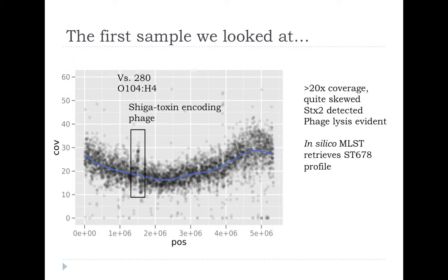So they sent us some samples, and the very first sample we looked at, we were very pleased with what we found. It was known to have a high abundance of the Shiga toxin producing E. coli. And what happened was that Nick Loman in my group at the time took the metagenome. We sequenced it on a benchtop instrument, the MiSeq, 1 sample, 1 run on the MiSeq.